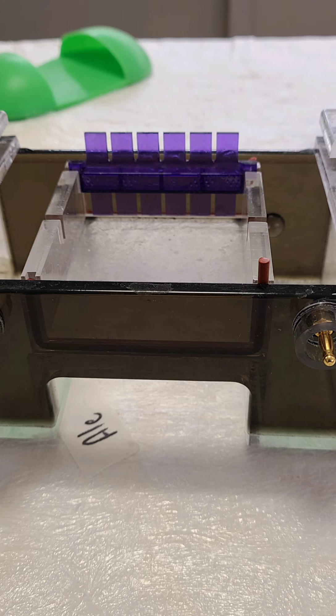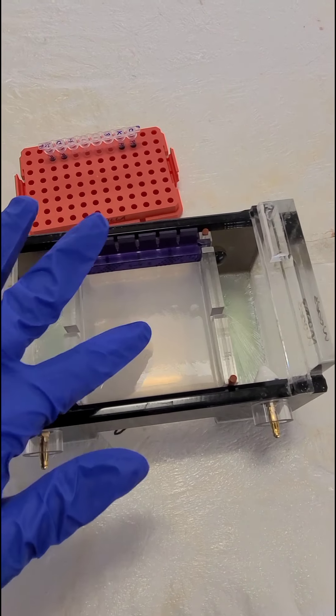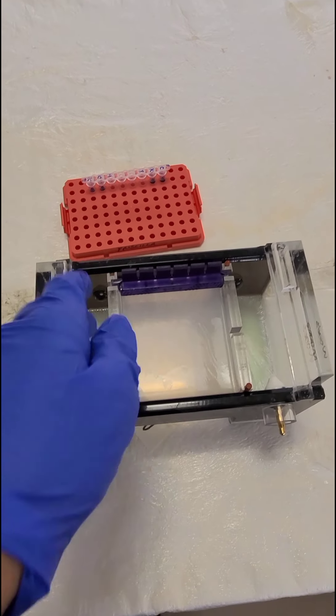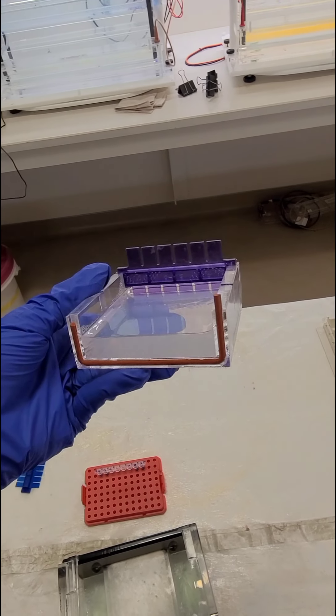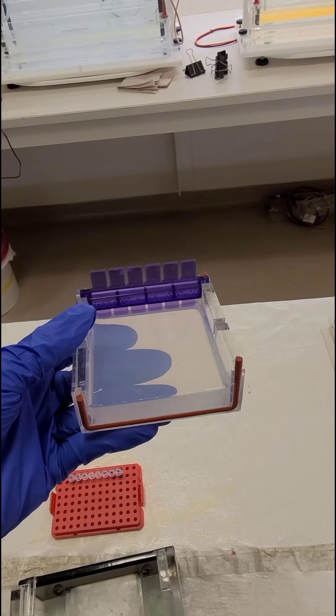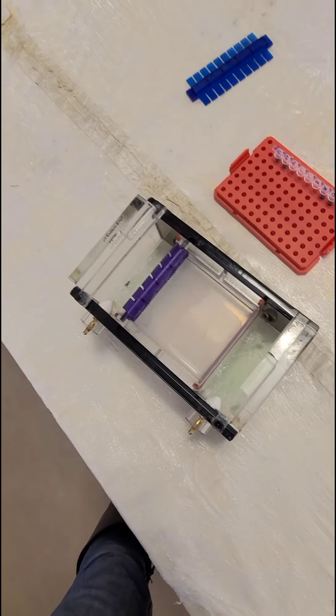Once finally back in lab, it was time to do a gel extraction because I've been trying to determine for the past few months if there is a deletion in the promoter of my gene. To do that, we need to extract the bands from the gel and sequence them to determine if the bands are what we think they are, and we do that by making a very thick gel. The wells in the gel can hold up to 50 microliters.